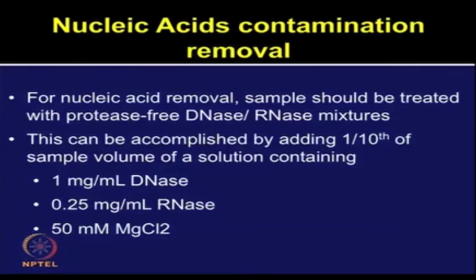Please perform these steps in the cold conditions. Try to keep this reaction in ice, so that you are effectively performing the nucleic acid contamination removal.